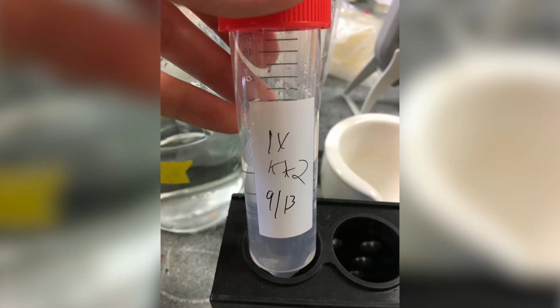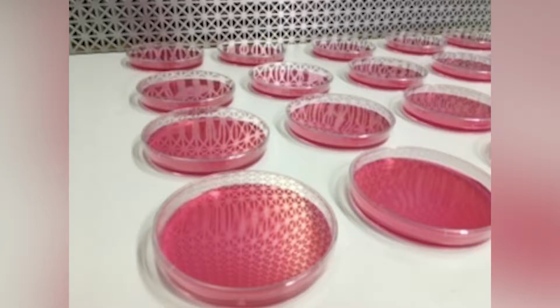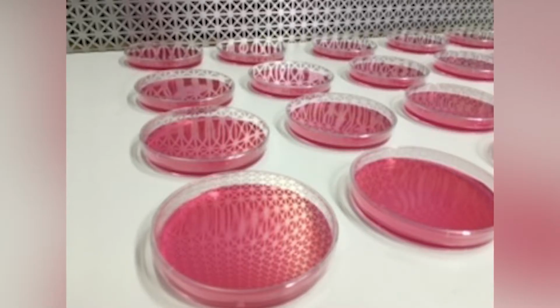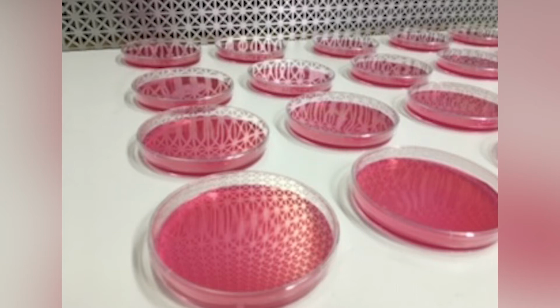To do this, I first swabbed samples of 20 different phone screens. These samples were suspended in buffer liquid and then spread on two different types of plates. One had selective growth medium on it, which is nutrients that are especially supportive to Staphylococcus growth, and the other plates had growth medium that was infused with ampicillin. These were incubated at 37 degrees Celsius for overnight growth. And then I did some tests.